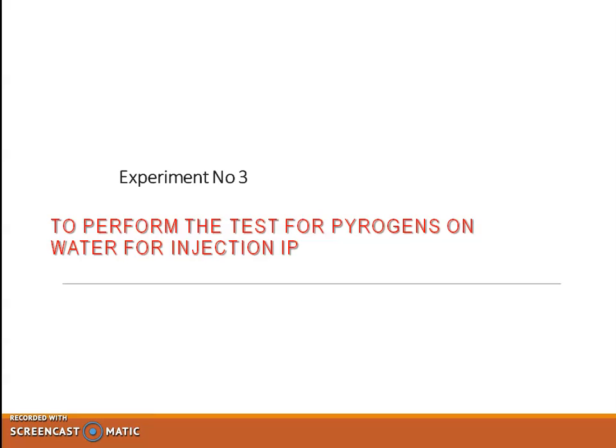Today we are going to start with experiment number 3: to perform the test for pyrogens on water for injection IP.